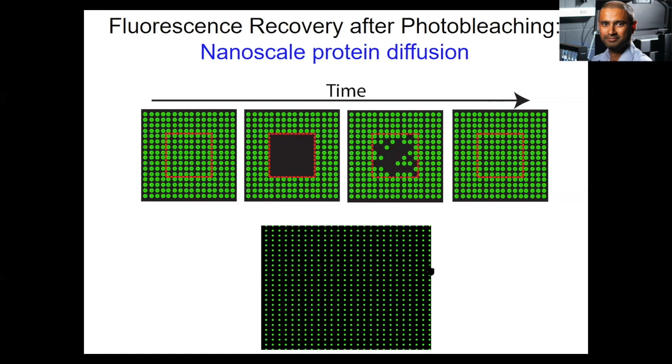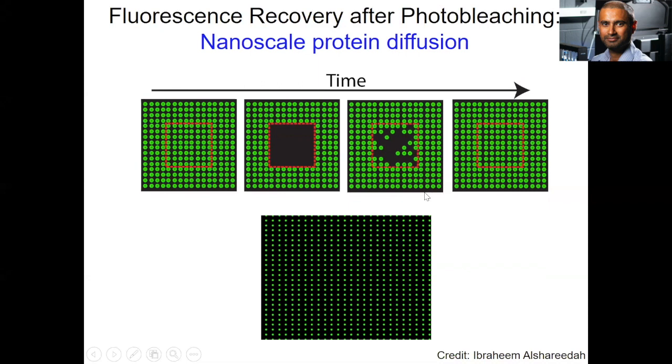Okay, so using FRAP again, we could study how protein molecules or RNA molecules diffuse within these condensates, and that gives you some sort of idea about the liquidity. Although strictly speaking, there could be diffusion behavior for molecules with differential interactions with the condensate matrix, and that could give you some sort of false positive. So you need techniques beyond just FRAP.